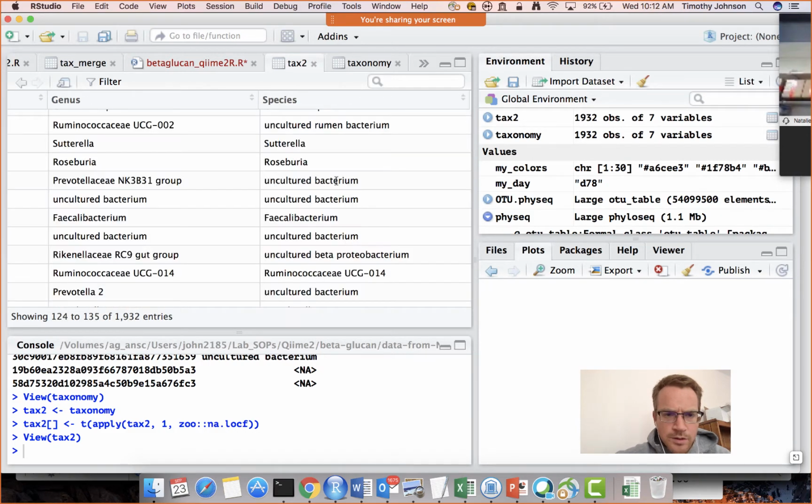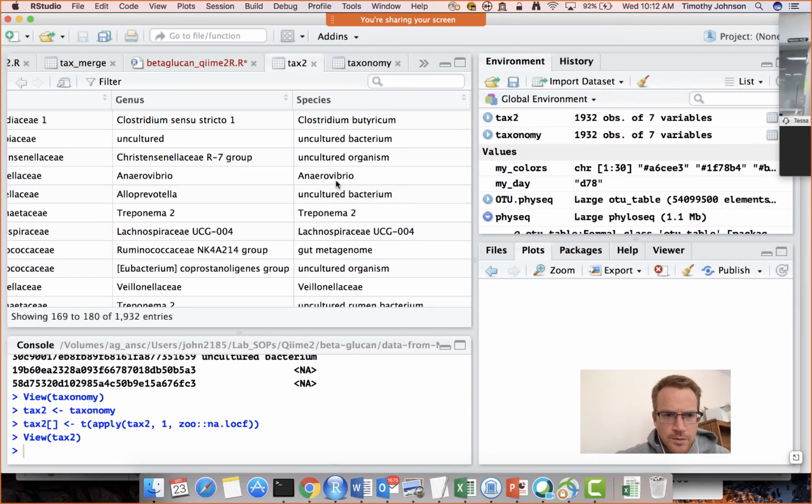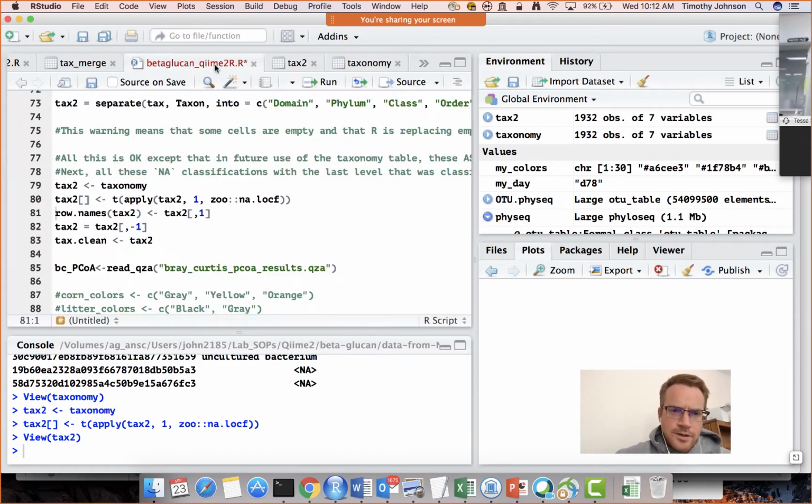Okay, yeah, that actually worked. So yeah, this line, it did. This thing here, I did not write this, and I had to Google to find out. So I don't expect you to understand it because I don't really understand it. But what this does is it looks for an NA, and it's going to take the value in the column to the left of it and just put that into where the NA was.